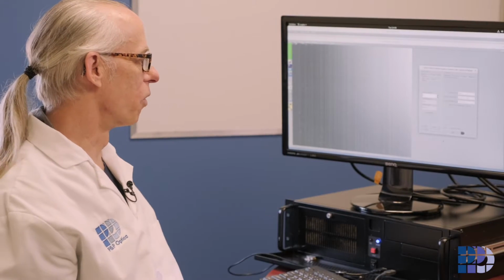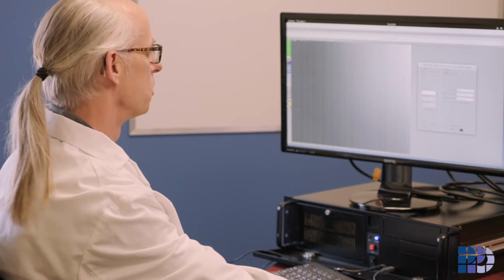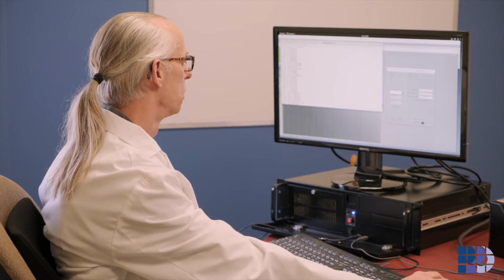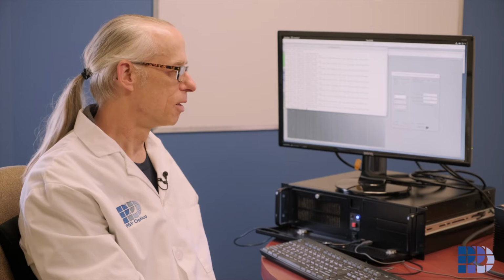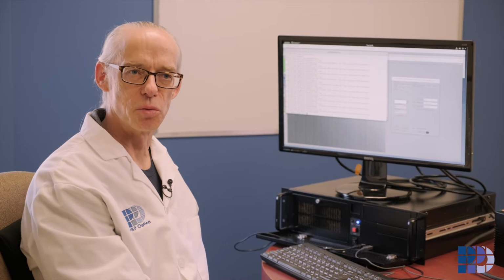Some of the tests that I run here are looking for bad pixels on the camera. When we first onboard a new camera, we have to make sure that the performance is what we require. Make sure that the camera is running the same protocol and is going to work with our software. These are complicated software animals themselves, so we have to make sure that the firmware interface to the camera remains compatible with our software and will work in the system.